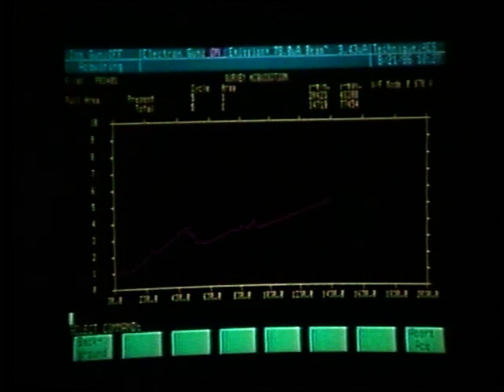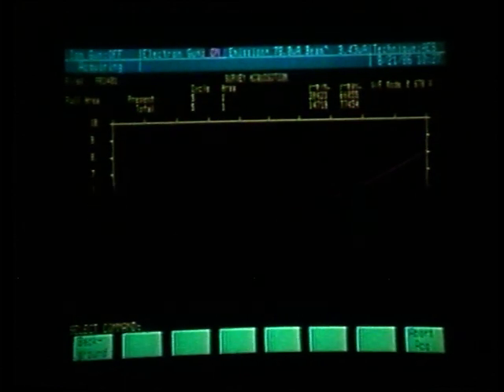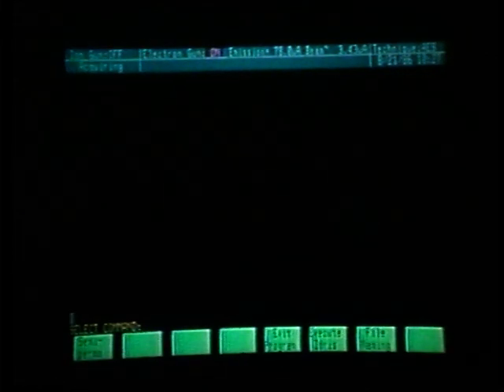We can then evaluate the data. If we do not have good enough signal to noise, we could take more data, signal average, to this file, being PRO 401, by utilizing the more key, which would be function key number 12.